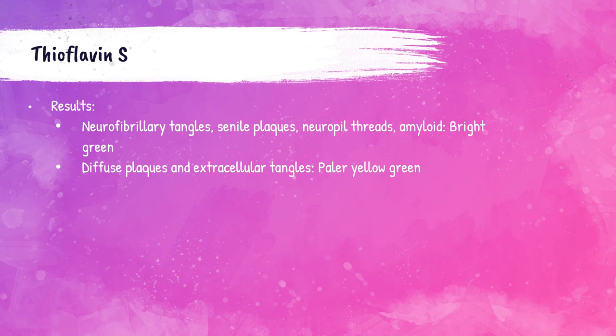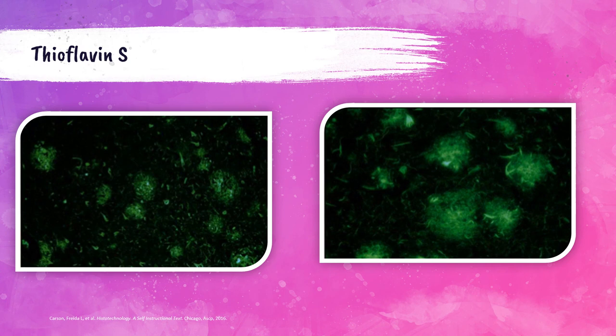Photos show brain tissue from an Alzheimer's patient stained with the Thioflavin S method, displaying senile plaques, neurofibrillary tangles, and amyloid. The second photo shows the same tissue at higher magnification.